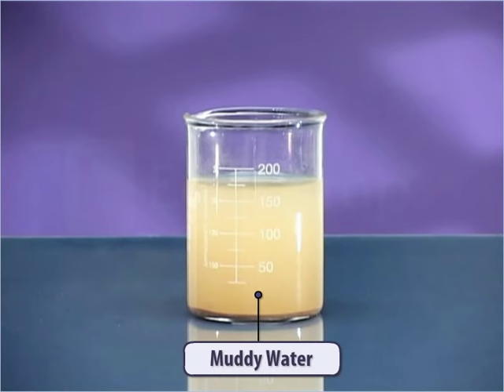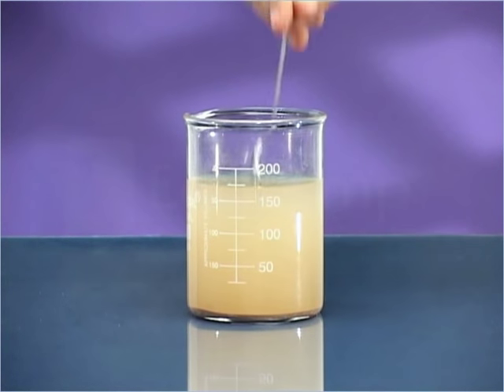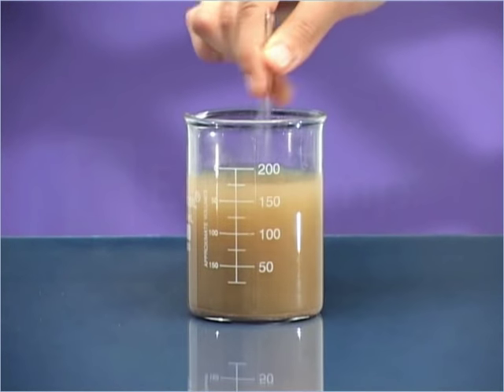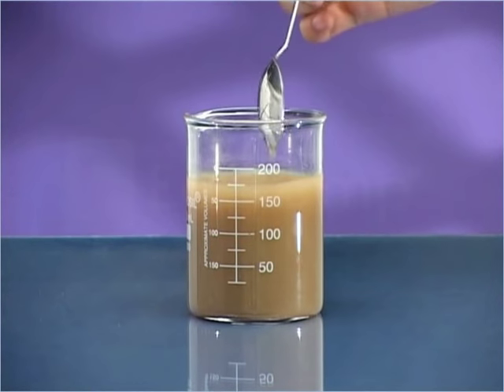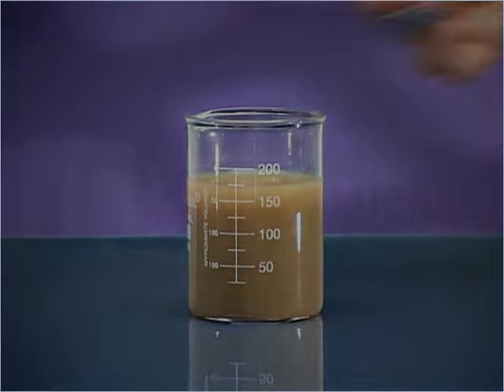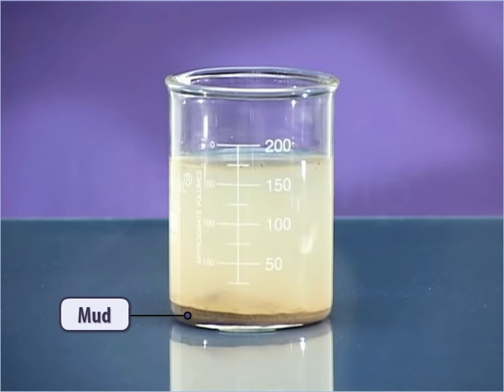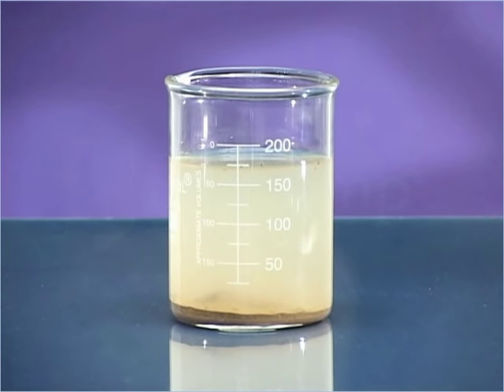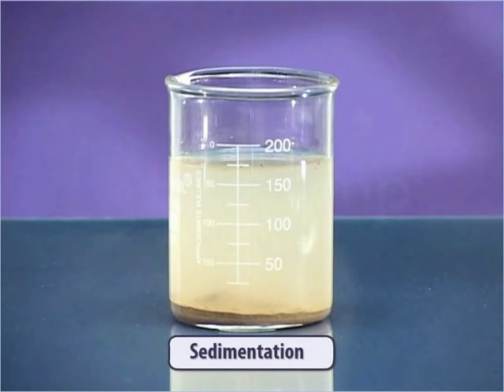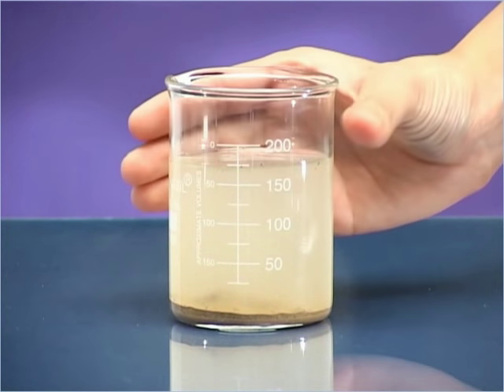Take some muddy water in a beaker — it is a mixture of soil and water. Stir this mixture well and leave it to settle for half an hour. The mud settles down at the bottom of the beaker by the process of sedimentation.